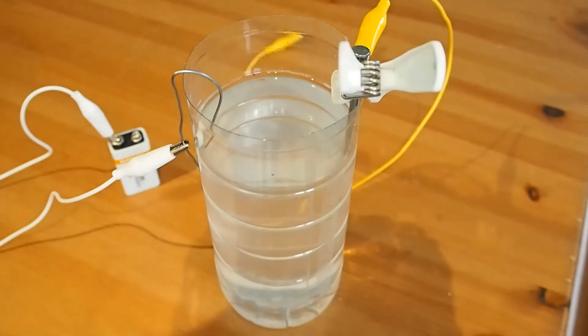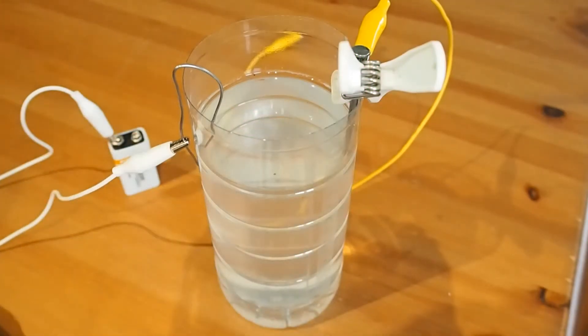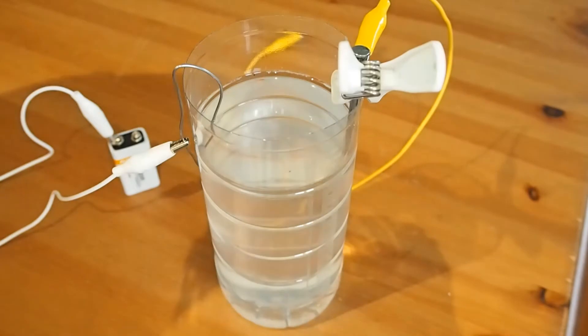Salt solution in here. I've just got a simple bit of iron on the cathode, and that's where our hydrogen gas is going to be generated. And then over here on the anode is where our iron oxide should be generated.